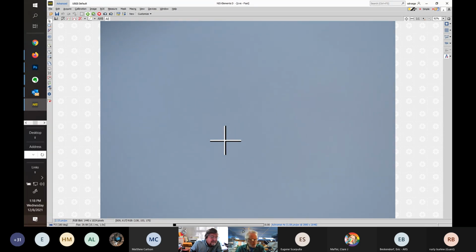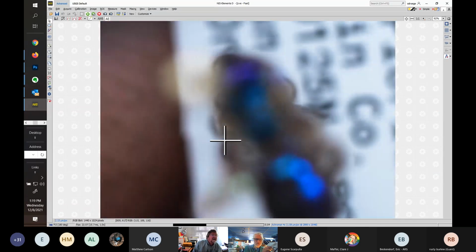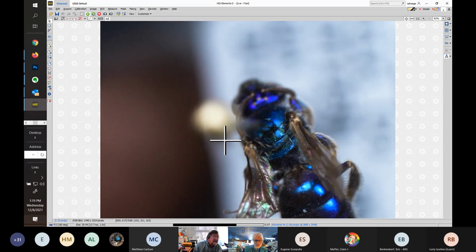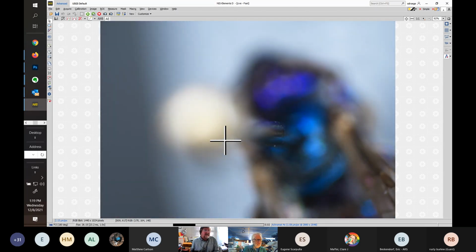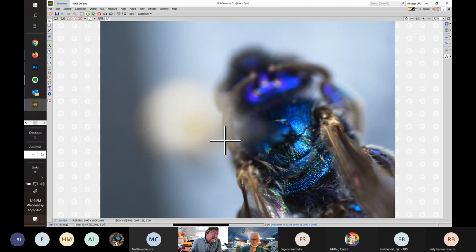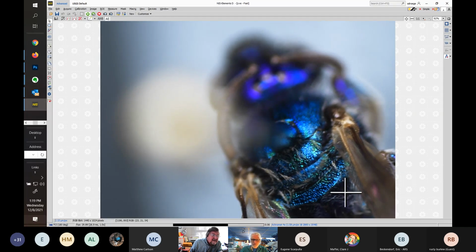I'll pull up a gratiosa here now. So I'm pulling up a gratiosa. This is from Florida, and you'll see this color is very unique, but it's a red herring, so to speak, because a lot of species that we are reasonably confident are species turn bluer if they're metallic green. And they also turn oranger if they have yellow components for some reason. Now that's a good shot of the narrow surface of the propodeum versus the median length of the metanotum.